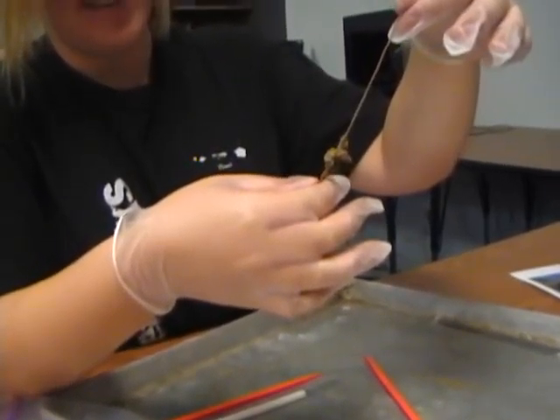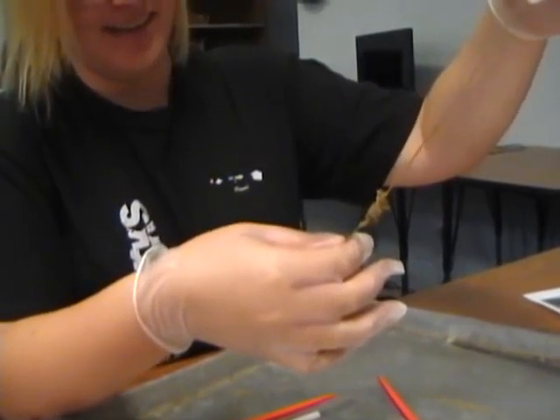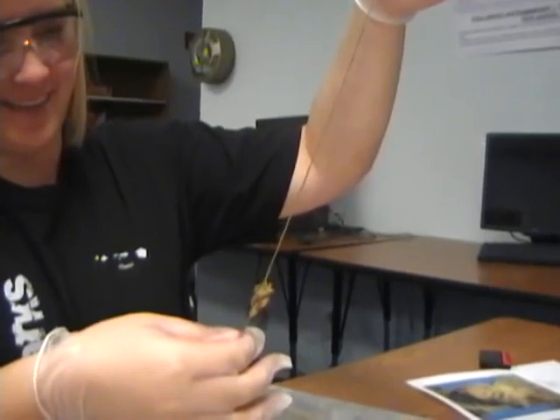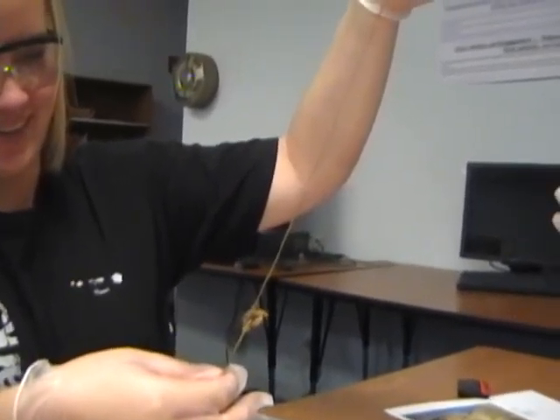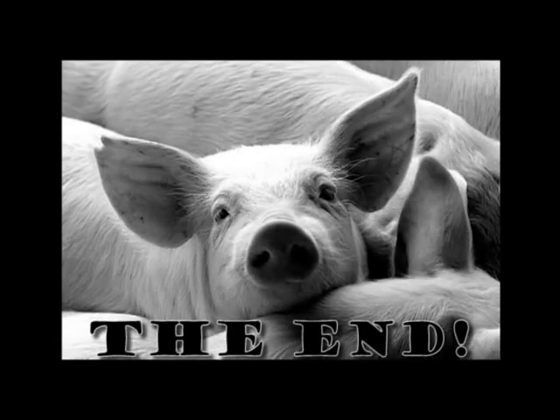Okay. The gloves are the very last thing you take off. Okay, guys, time out. We gotta go ahead and get cleaned up here. It's 9:11. You got 9 minutes. After you get your final shots, I need every piece of pig.